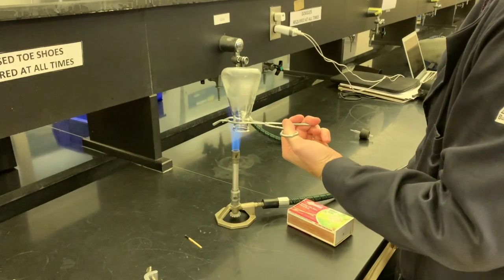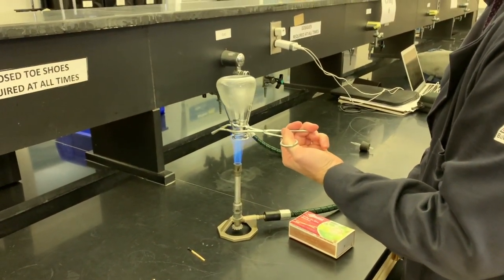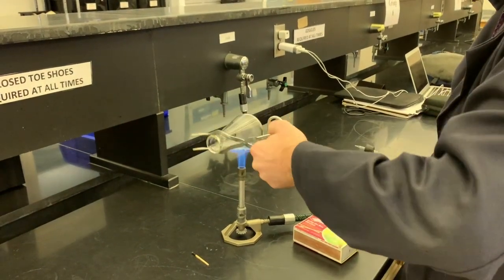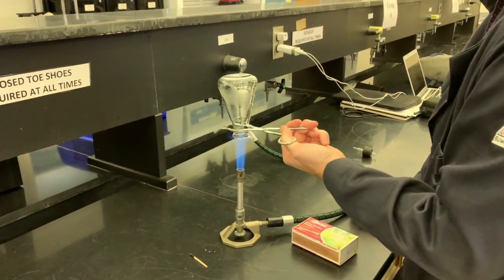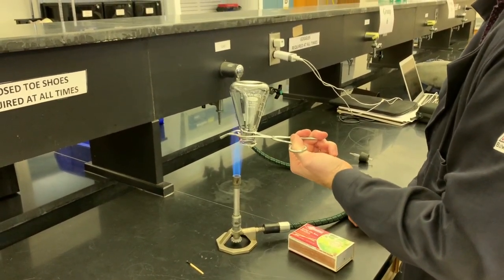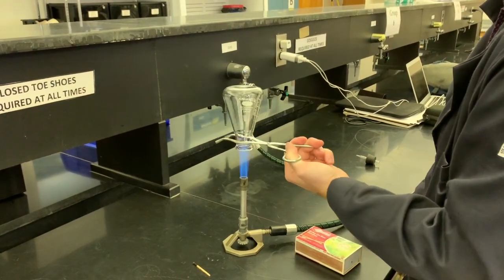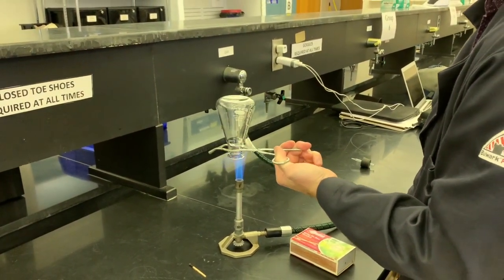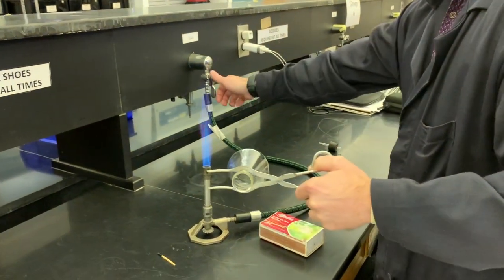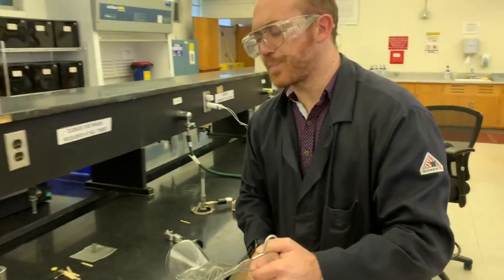I already heated it a little bit beforehand, but you can see a little bit of water vapor in there. And that's mostly caused by water that settles on the surface of anything that's cold, especially surfaces that are somewhat polar, like let's say glass in particular. So you only need to give it enough heat to get rid of a lot of that vapor. If you can't see vapor anymore, you're probably not going to be worrying too much about any more water. It's pretty small as far as the actual content goes anyways, but it's worth removing.